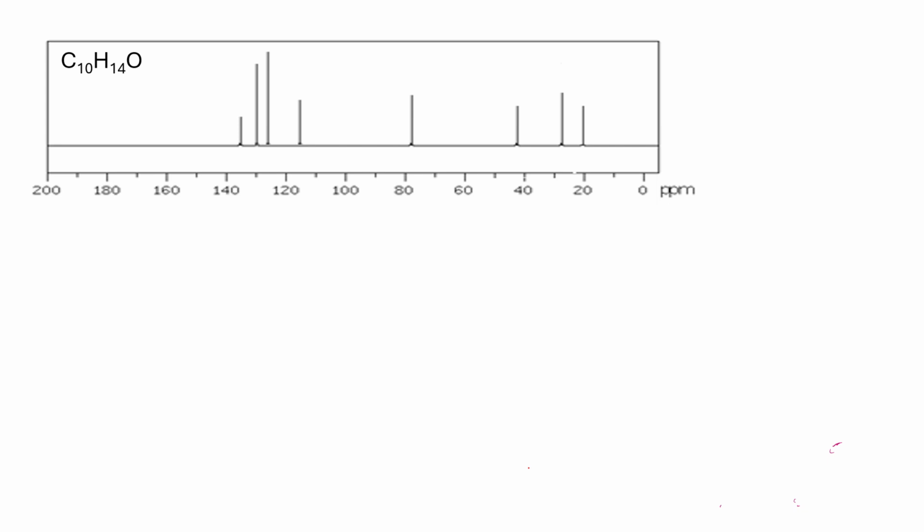So let's just note that point down because that's important. So we've got 8 peaks, but 10 carbons, which means that there is some equivalence in the molecule. So as I say, that could mean symmetry, or we'll see once we get a bit more information what that's likely to be telling us.